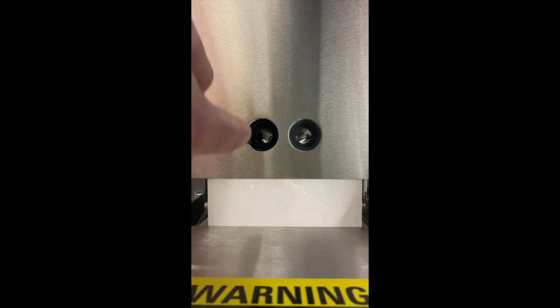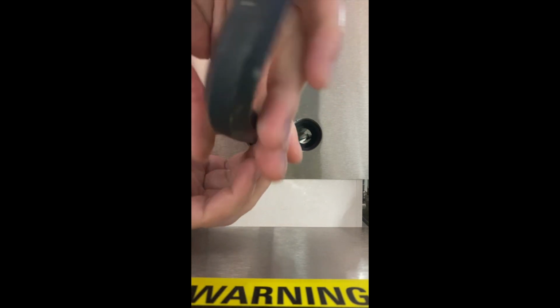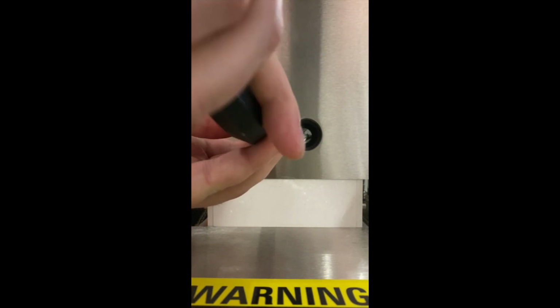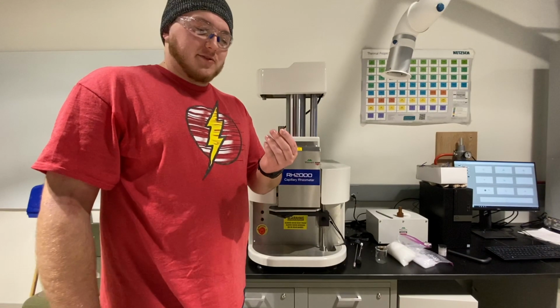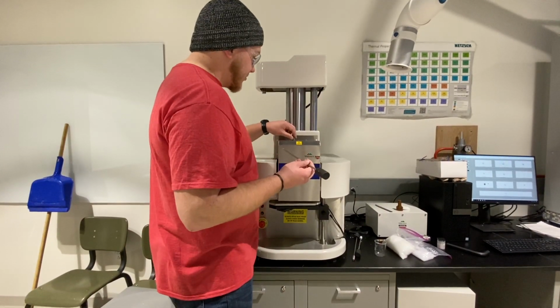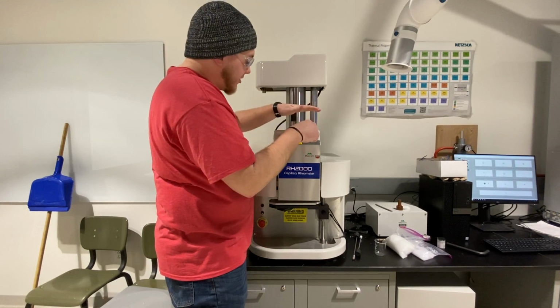Alright, so we're going to install our die holder, which is just this thing. And it's going to go right here, and this is our left barrel. I'm just going to essentially put it onto our giant Allen wrench, screw it in. And everything on this machine gets hand tightened only, just essentially until you can't do it anymore, but not so tight that we start ruining the machinery. So we're going to install the die. We're going to put it into our preheated left barrel. Just going to drop it in. Assuming it doesn't get stuck on stuff, I'm just going to push it out.